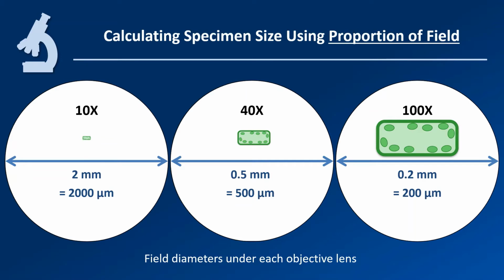Let's take a look at an example to show you how we can figure out the size of a specimen using this particular information.